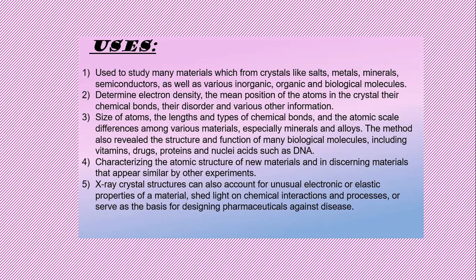X-ray crystal structures can also account for unusual electronic or elastic properties of a material, shed light on chemical interactions and processes, or serve as a basis for designing drugs against disease. These are the uses of X-ray crystallography.